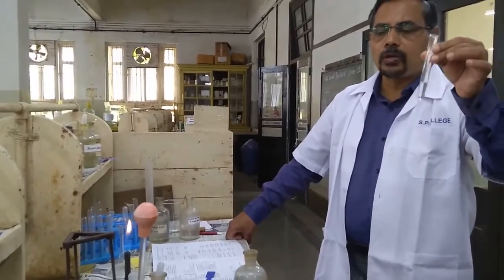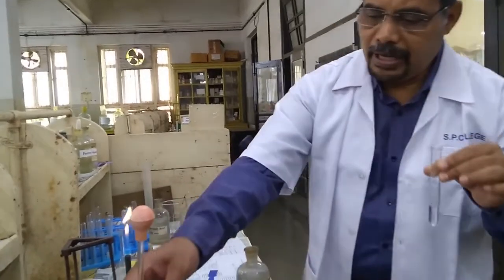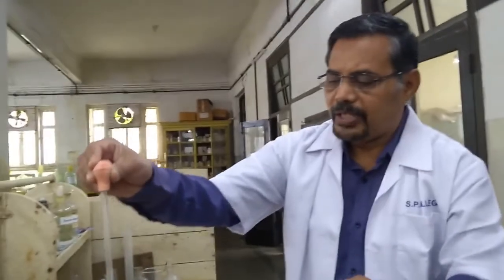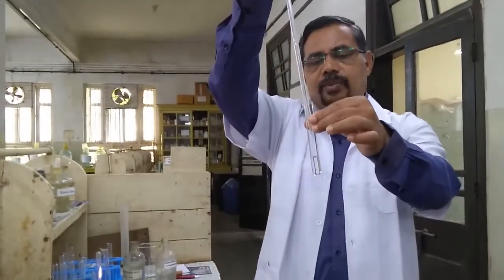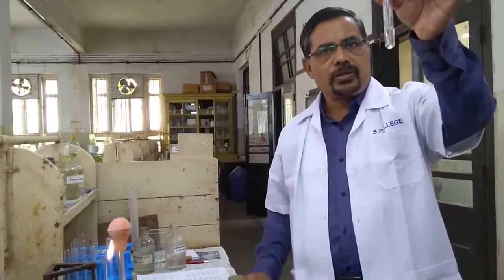Now we will go for the group 2 test. So this is original solution plus dilute HCl. I will add a small quantity of H2S water in this. So with the help of this dropper I will add H2S water. So this is OS plus dilute HCl. Then a small quantity of H2S water is added. Then there is no precipitate formation. So this indicates the absence of group 2 in the given mixture.